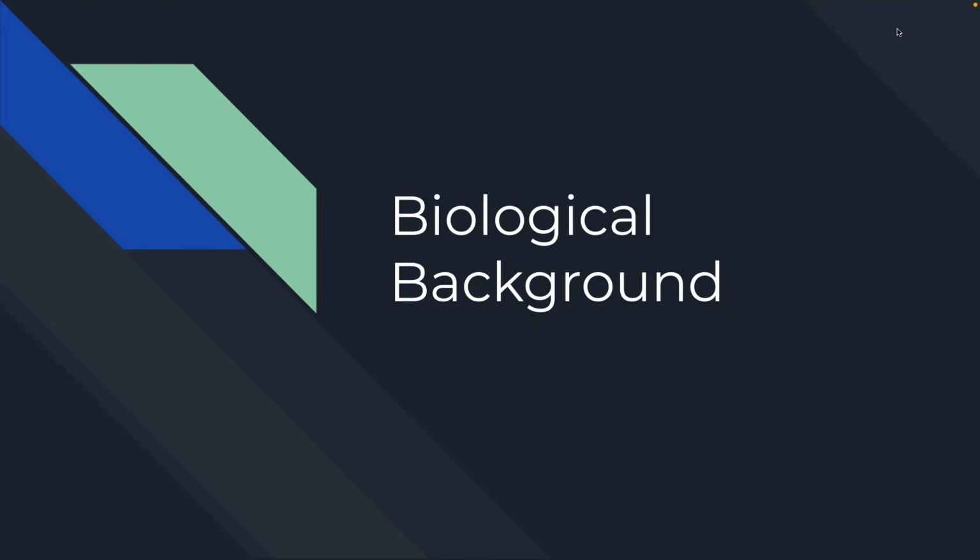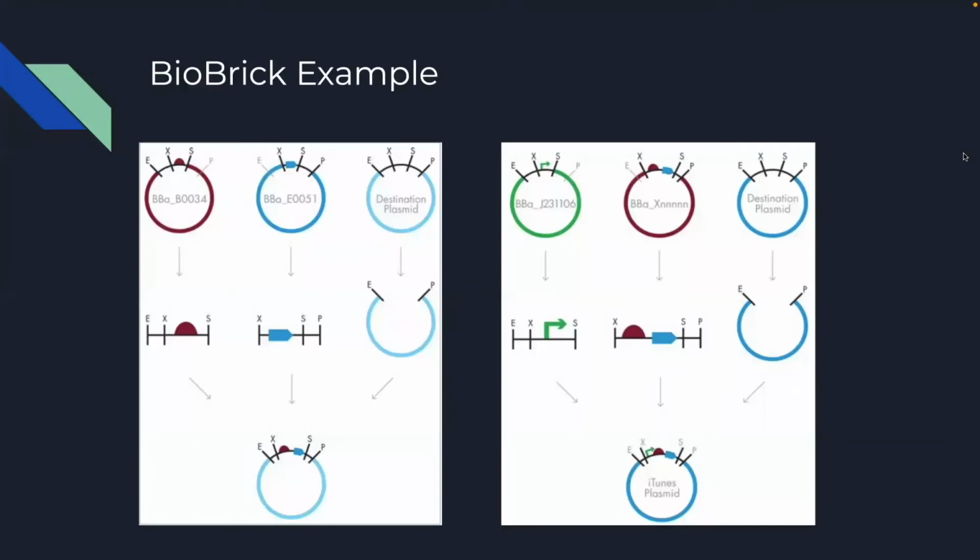Hello, I'm briefly going to touch a little bit on the biological background of our tool and some of the code that was used to actually implement the scars themselves. So firstly, I want to go over quickly the BioBricks standard, which is the first assembly standard that our tool supports. It's the most commonly used standard in DNA assembly within synthetic biology at the moment, and the majority of the iGEM registry of standard biological parts is compatible with the BioBricks format.